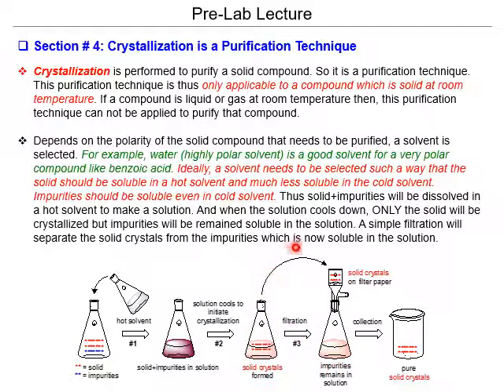Because then, once it gets cold and the more crystals form, you'll put it here in the filter paper, and these very pure crystals will remain, while the impurity will still remain attached to the solution, right?